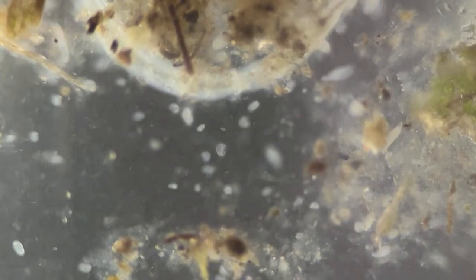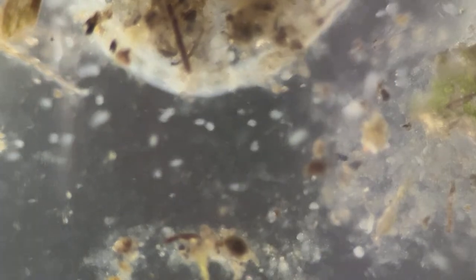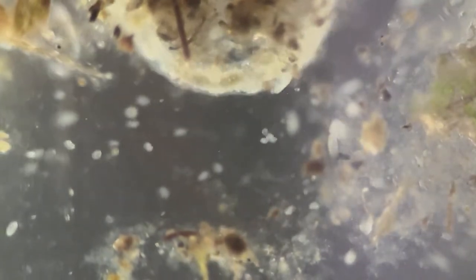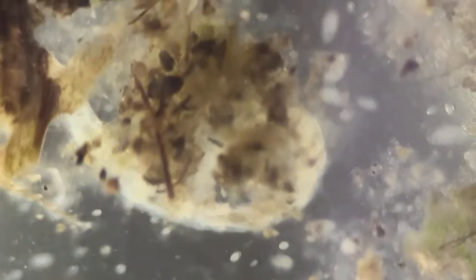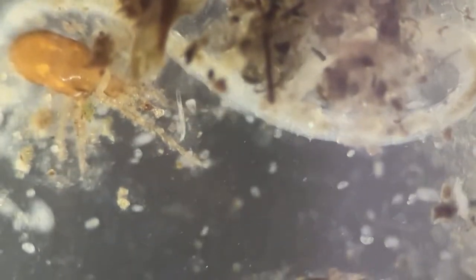So, do we find something? Not yet. Okay, let's move the slide a bit. Please come out in the open.